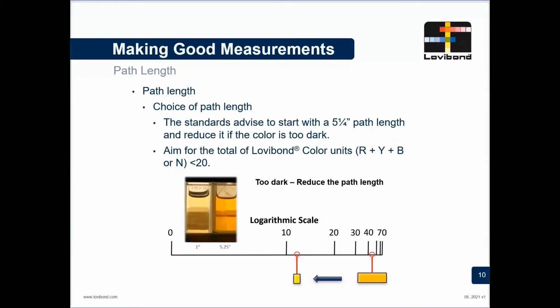So I might have a much smaller variation in my sample. This is because here we're in a more sensitive region, and it's going to give us the best way of measuring our sample and the best area for comparing our sample with other people.